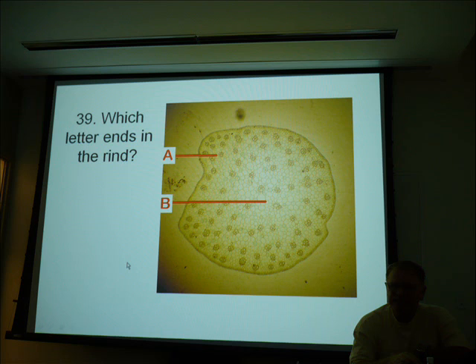The rind, inside or outside? Surface or deep? Surface. It's near the surface. The rind contains more vascular bundles than the medulla does. That's why that's the rind. And if you eat a watermelon, you always throw away the rind. So that's the part that you trash.